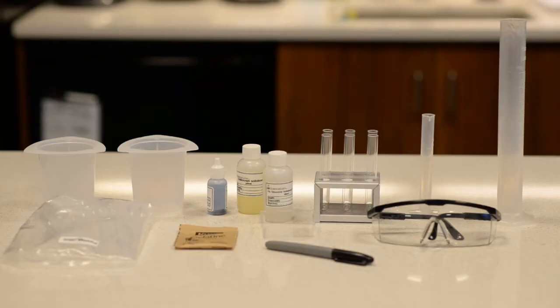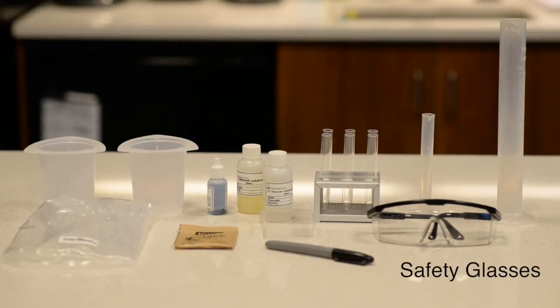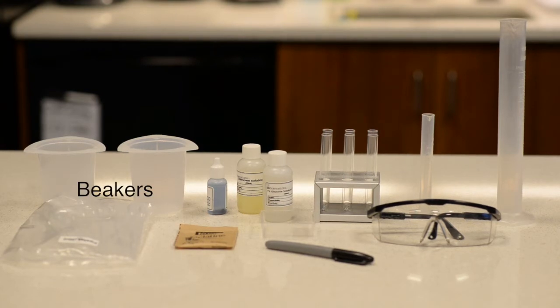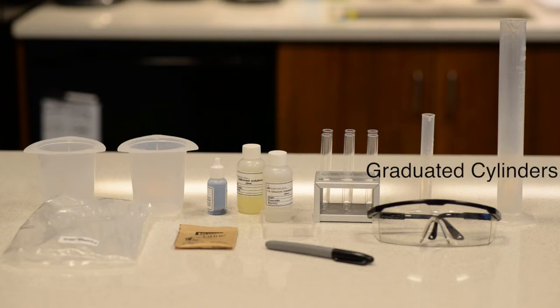Your kit will come with everything you need: safety glasses, test tubes, beakers, solutions and reagents, pipettes, and graduated cylinders.